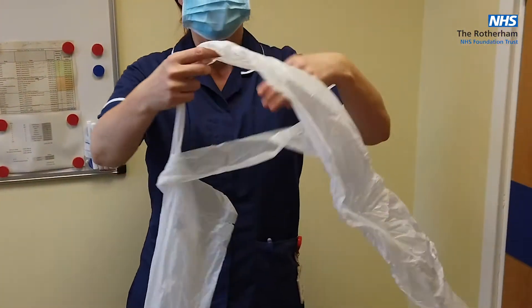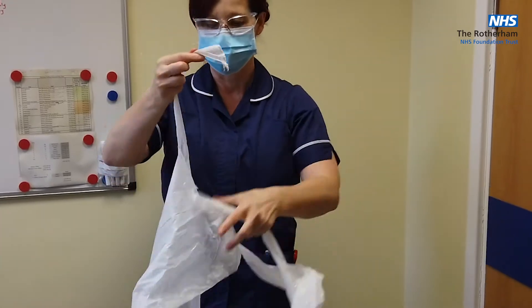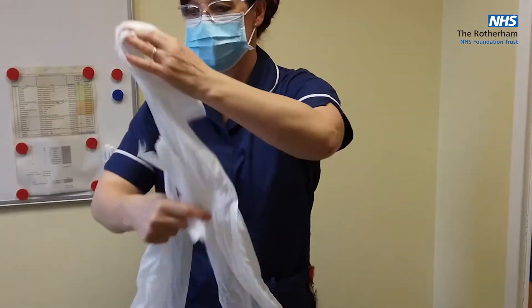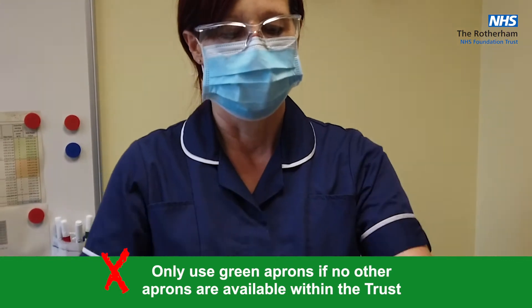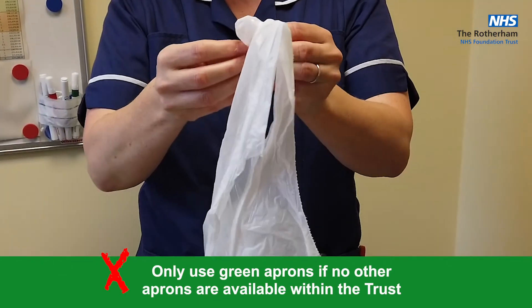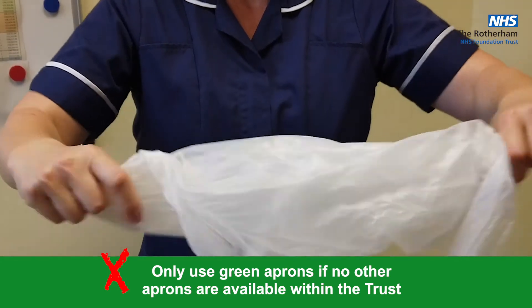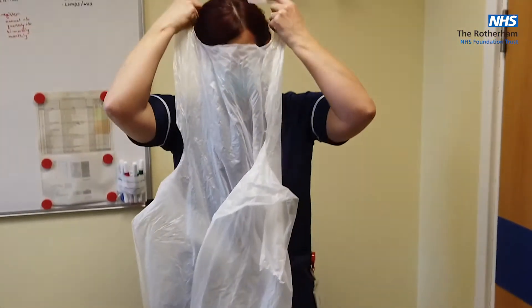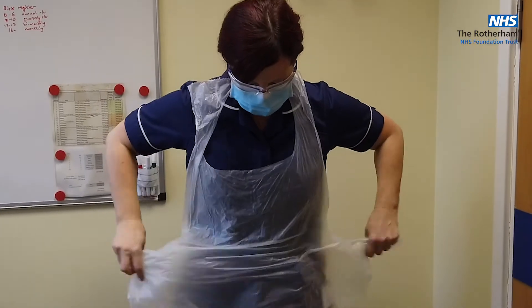For your apron — pre-COVID you would have found that they were colour coded for things such as catering staff and nursing staff. At the moment the national supply is whatever colour we are getting, so please don't worry about the colour coding currently. Open your apron, over your head, and tie around the waist.